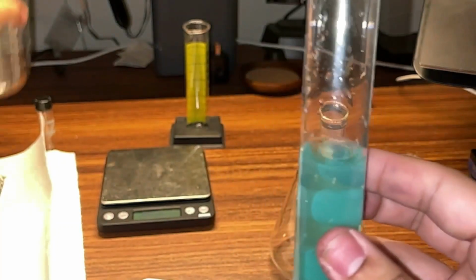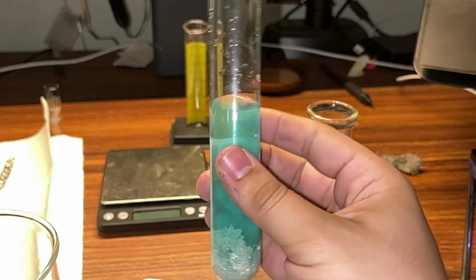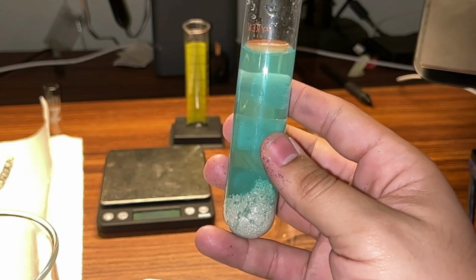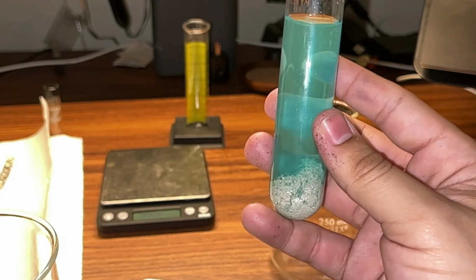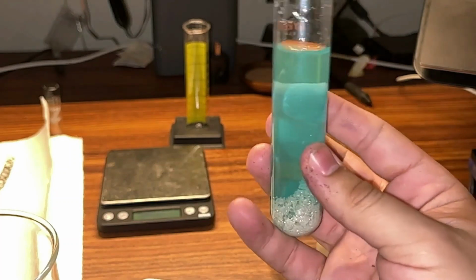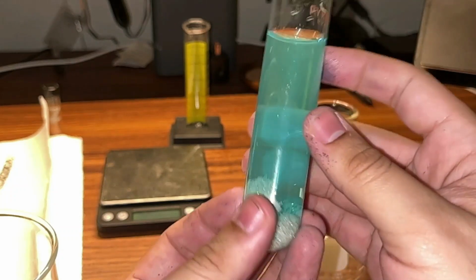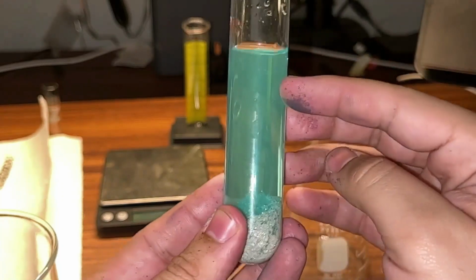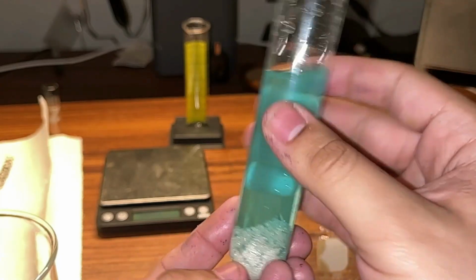You might remember that I did another single replacement reaction as a demo before spring break, where we did aluminum foil with copper chloride, I think. No, it's copper sulfate. And that copper sulfate was also this blue color. So you might know a little bit about copper and copper oxidation. Think about old pennies or the Statue of Liberty. Copper is normally associated, I'm not sure exactly why, but it's associated with this blue color. You get this blue color happening a lot when copper is involved in compounds. And a bunch of solutions that contain copper ions definitely are blue, or this blue-green color.